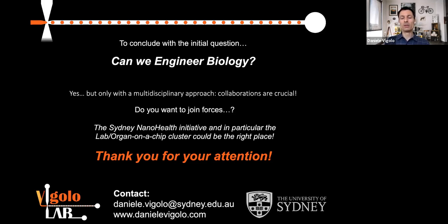And so really the aim is this standardized approach, because at the end of the day, microfluidics gives you the chance to have an environment which is fully controlled, where you can change each parameter one by one in theory, and then create a table essentially of risk factors. And that will be very powerful, in my opinion, also to transfer into healthcare practice, because it will give a practical way to quantify things and see how this will affect the final output, for example, of DVT.